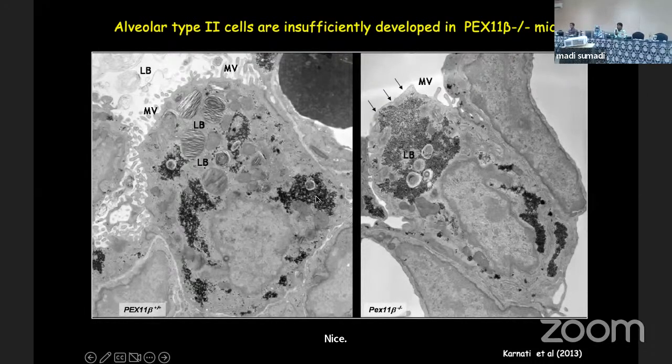And you also see very nice glycogen, lamellar bodies and a nucleus, the typical structure of a healthy cell. But exactly that is missing here. You do not have the lamellar bodies. If you do not have lamellar bodies, you do not have respiration. Lungs collapse at expiration. If you do not have lamellar bodies, lungs collapse, which means you have respiratory distress syndrome. Animals die. This is what is happening.